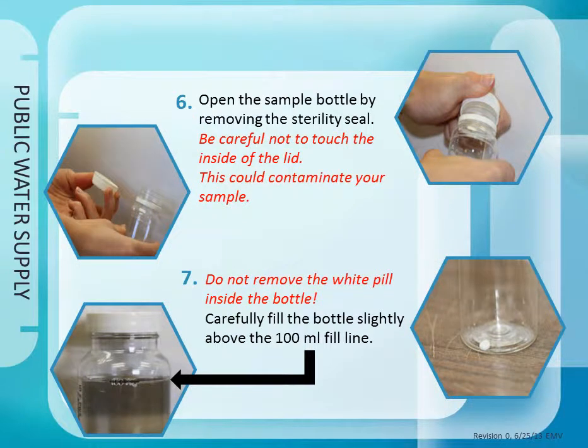Step 6: Open the sample collection container by removing the sterility seal. Do not touch inside the lid or bottle — this could contaminate your sample. Step 7: Do not remove the pill inside the bottle; this is a preservative. Carefully fill the bottle slightly above the 100 mL fill line indicated on the bottle.